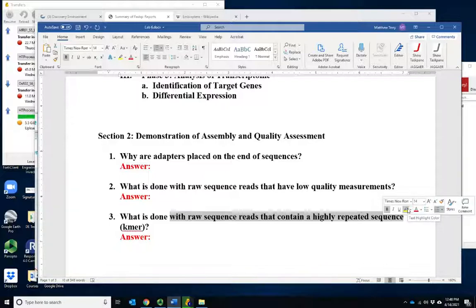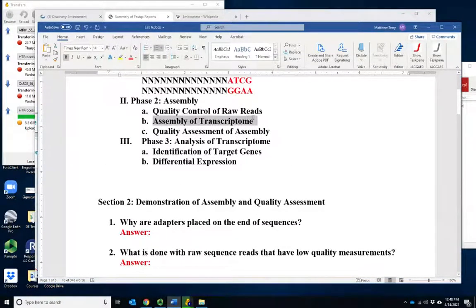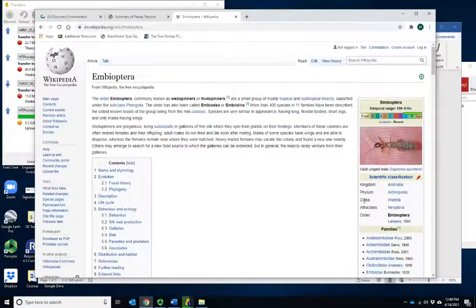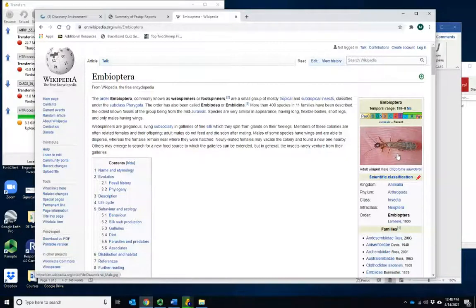Once we've done quality control and assessment, the next step is to assemble our transcriptome. We won't walk you through the process of doing that, but I'm going to show you the end result. This typically takes several hours, sometimes more, depending on your computing process and memory allocation for the run. The one I'm going to show you is for Embioptera, or web spinners. Some of you are familiar because you were assigned this in a previous lab, but most of you probably don't know much about web spinners.